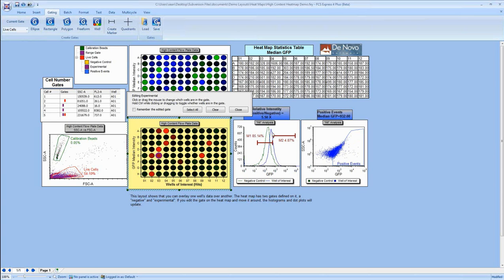Now, if I wanted to all of a sudden pool some of this data in this nice histogram overlay that we did, we can start control-clicking on some of these red wells, and we can notice that we're actually having some double peaks here. And the other thing I want to draw your attention to in this analysis is that we actually used a token here to look at the positive versus negative mean fluorescence channels, or the relative intensity of these things, so we know how much more positive relatively this blue histogram is from this green histogram. And in this case, the mean values make this 7.54 times more intense than the green channel.